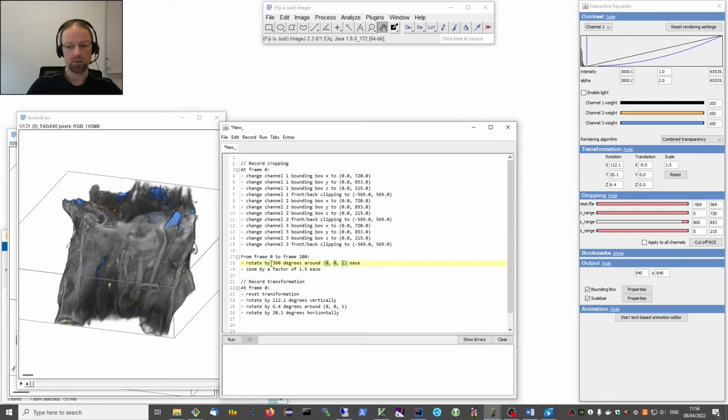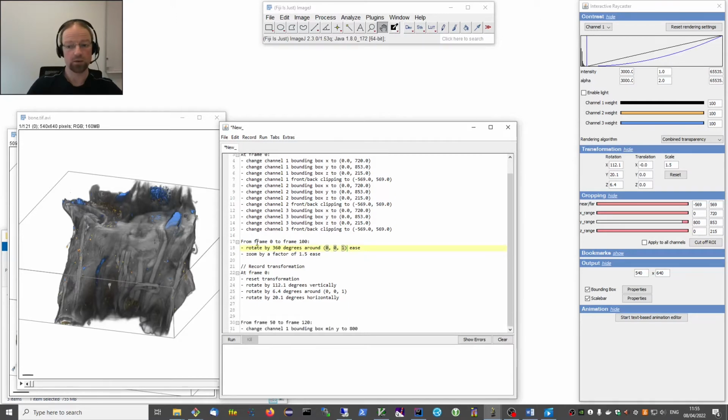And so now there's one more thing that we need to take care of. So we do this rotation, and then we transform to this initial rotation. But there's one thing here which is actually getting in our way, and that's a reset transform, which will basically take fully away the effect of this here. So we don't need it here, so we'll just delete this line here.